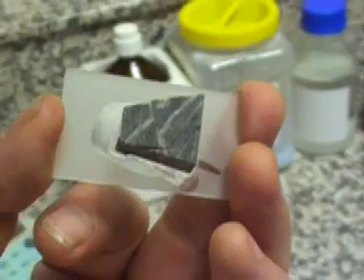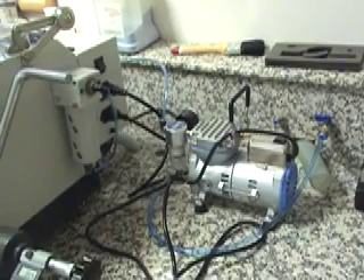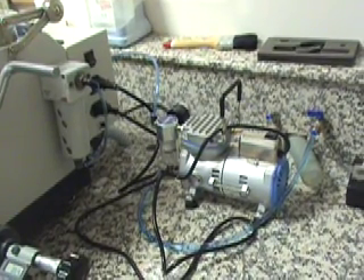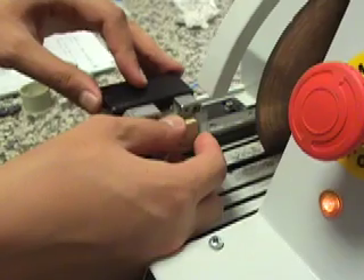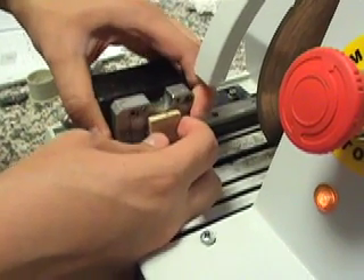The Geoform uses a vacuum system to hold the slides during cutting and grinding. A vacuum pump is supplied with the machine. To cut the sample to thickness ready for grinding, select vacuum on the left hand cutting station. Attach the slide and cut the sample using the vacuum jig and slide system.